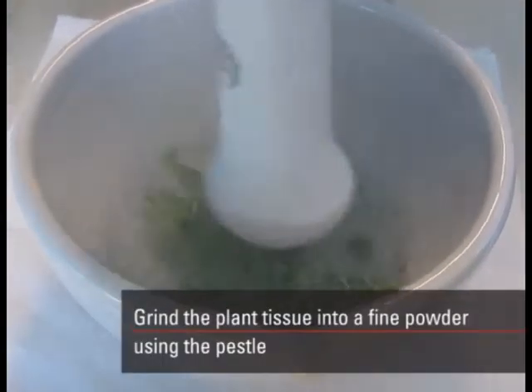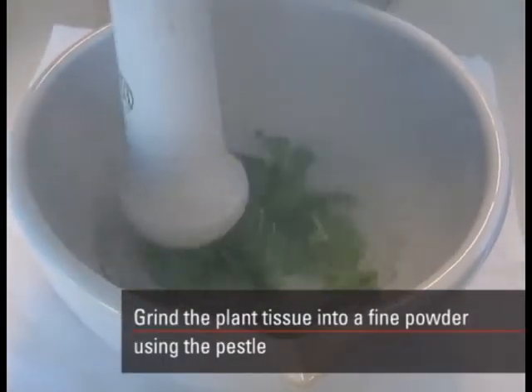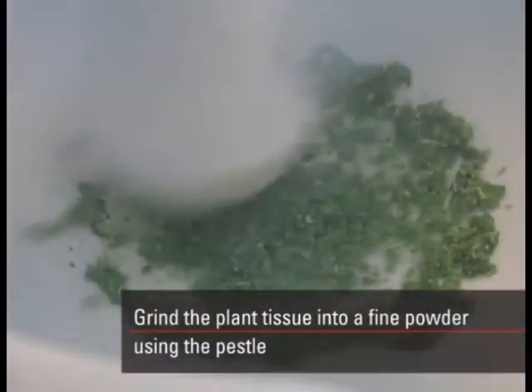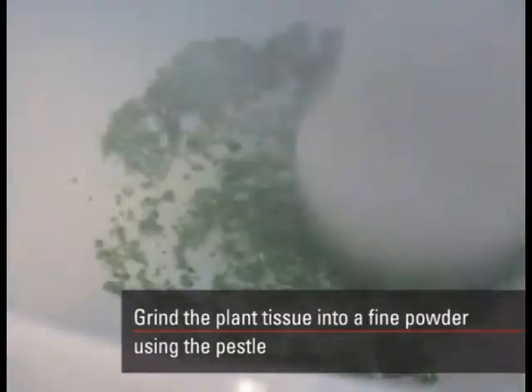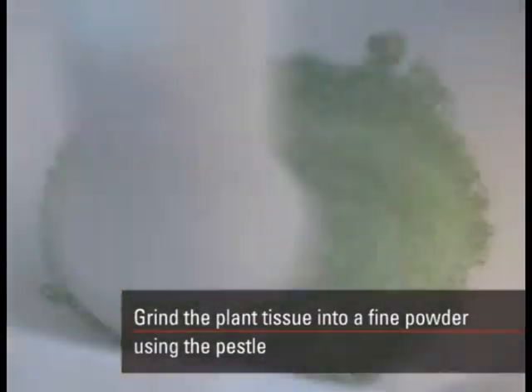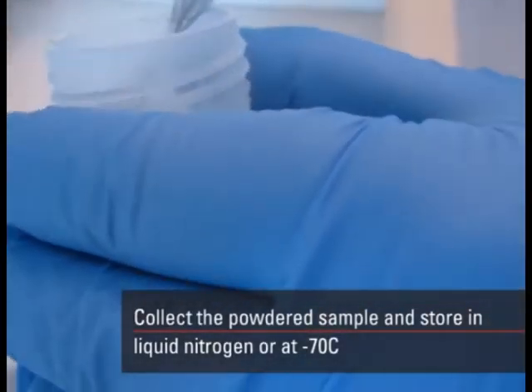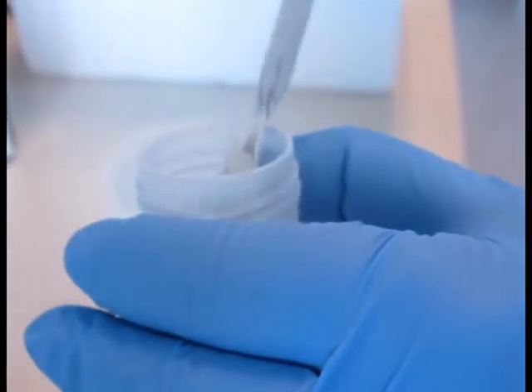Grind the plant tissue into a fine powder using the pestle. Collect the powdered sample and store in liquid nitrogen or at minus 70 degrees Celsius.